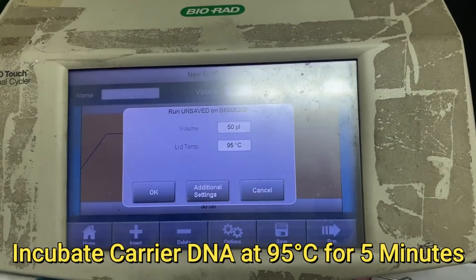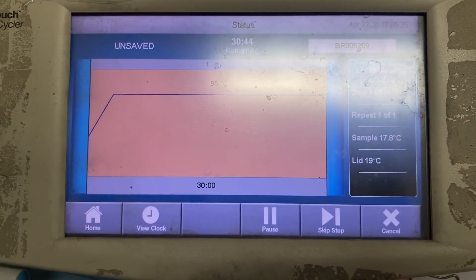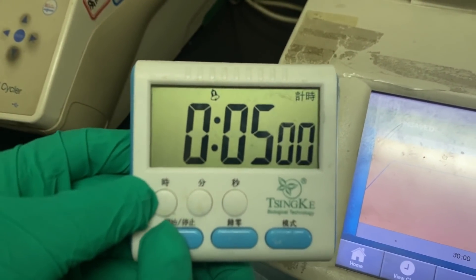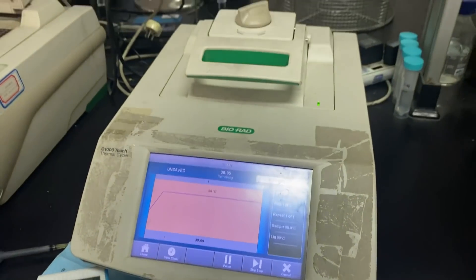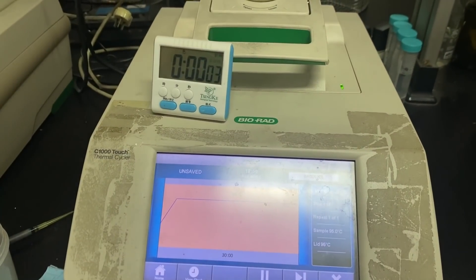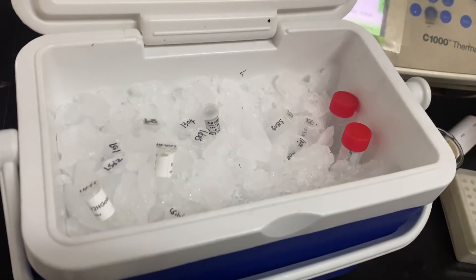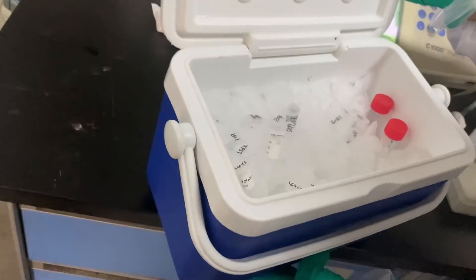Incubate at 95 degrees Celsius for 5 minutes. After 5 minutes of incubation, you need to put it back on ice, and then again you need to incubate at 95 degrees Celsius for 5 minutes. Then your carrier DNA will be ready for the next process.